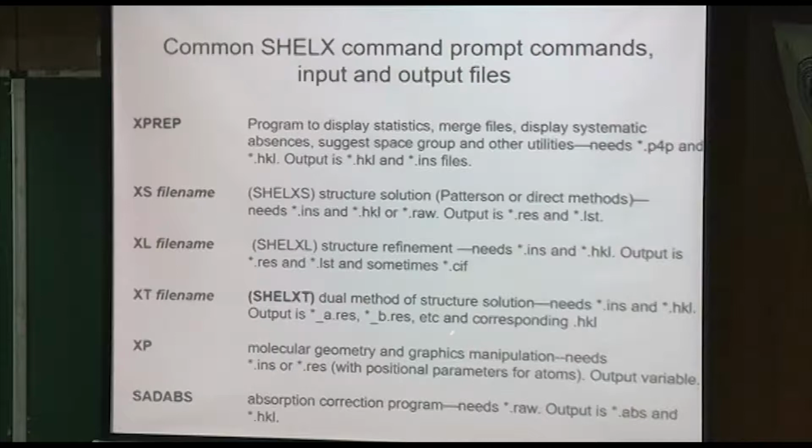Now, molecular geometry is, of course, necessary for solving a structure. You need to look and see if what you're doing is chemically reasonable. So I like to use XP, which was also written by Sheldrick. Unfortunately, this isn't on his homepage because it was put out by Bruker, but it actually is being used in OLEX2 and WinGX. So I don't know if you really have to worry about copyright anymore of XP because everybody uses it, or some version of it.